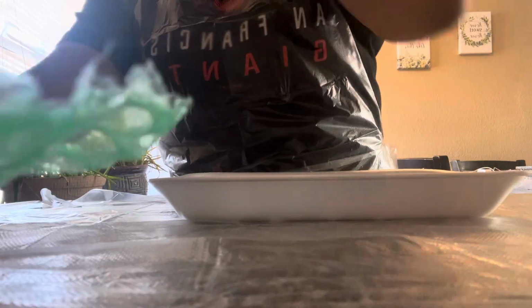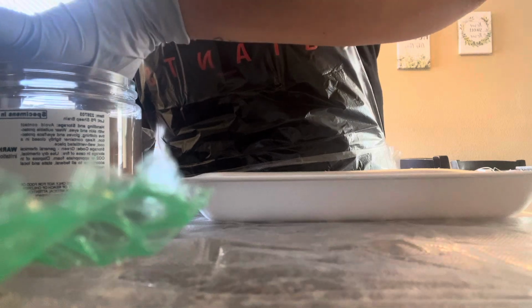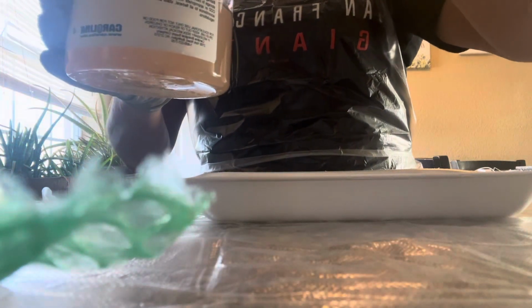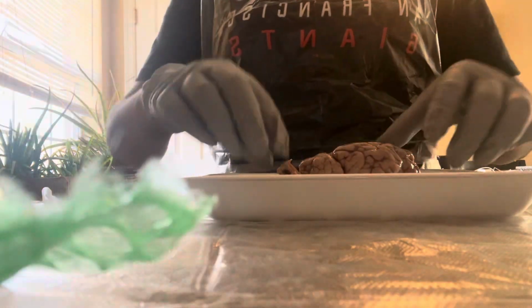Okay, so I'm going to start by taking out the sheep brain. I have it here, and I'll be placing it in this styrofoam. It does have a strong odor.